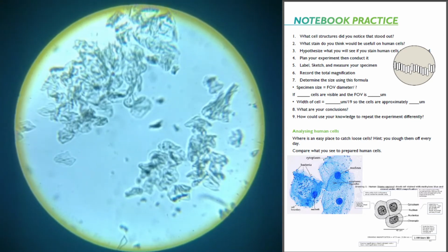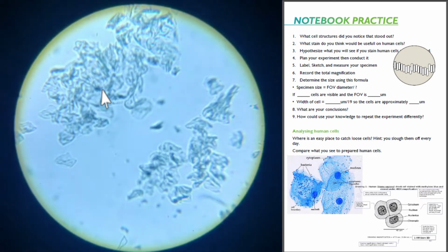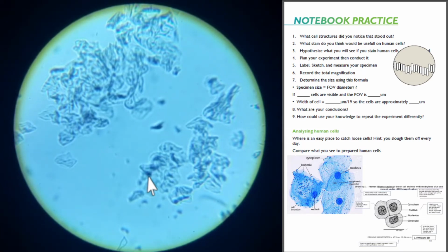You see the shapes? Especially right up here. See the cell? See the nucleus? Nucleus down here. Yep. Pretty cool.